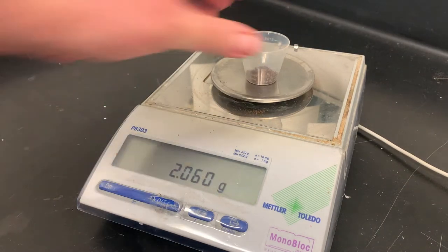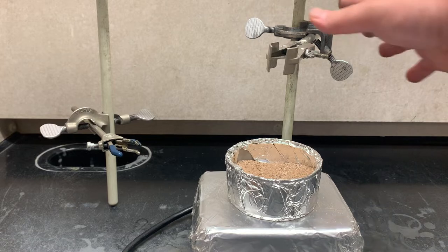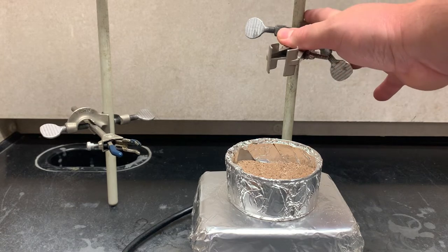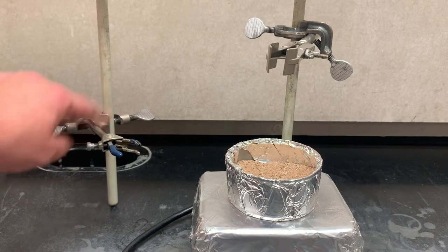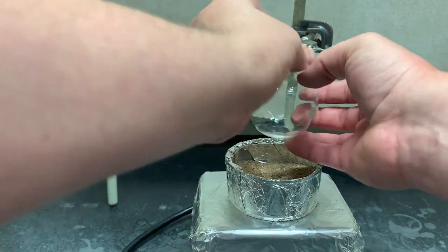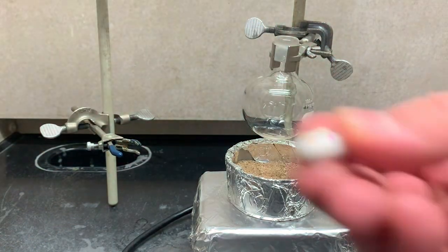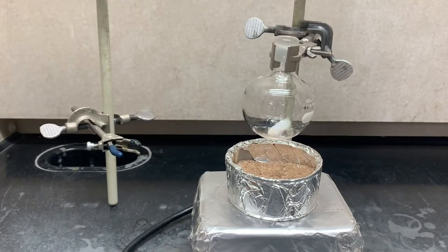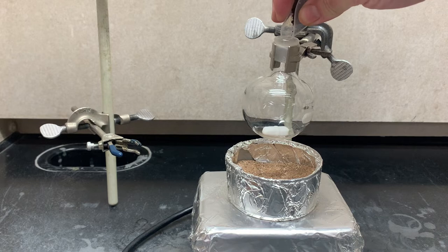That's good enough. So you can see here, we're actually gonna have three different clamps. One of them for the sand bath, you can't quite see that one. One of them for the actual round bottom, and then one to hold the collection flask. So we will start assembly here. Do that. Stir bar. Nice finely ground stuff.